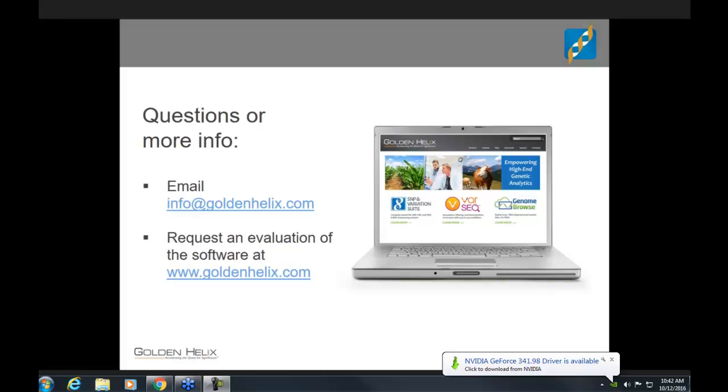First question here, is the CNV a standard feature of VARSeq? So, as I mentioned, this is going to be part of our clinical package. We really think this makes sense alongside having the ability to design your own custom reports. The one we gave you today was just an example. You can design reports that are customized to your labs, both in terms of presentation and in terms of content. We have other webinars in which we go through our clinical report and pipeline, our clinical package of VARSeq, so please check those out if you're interested.